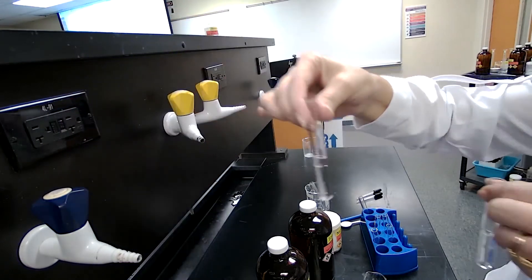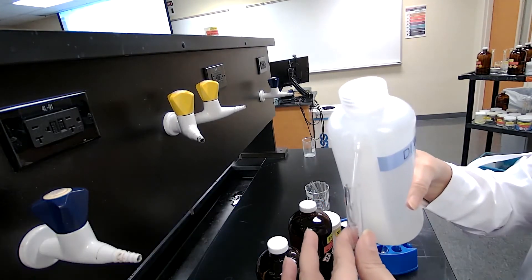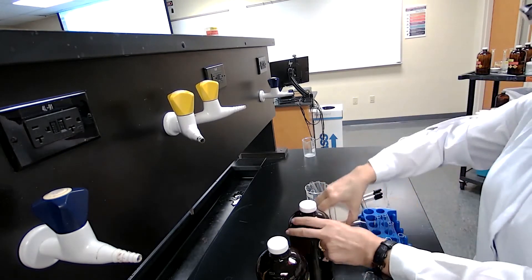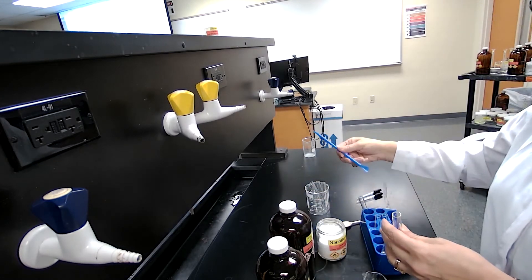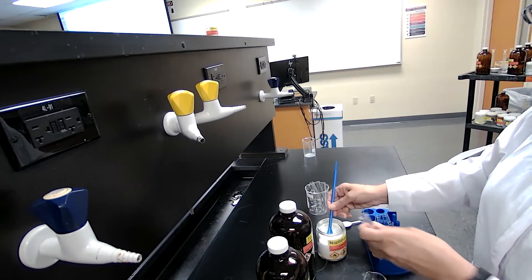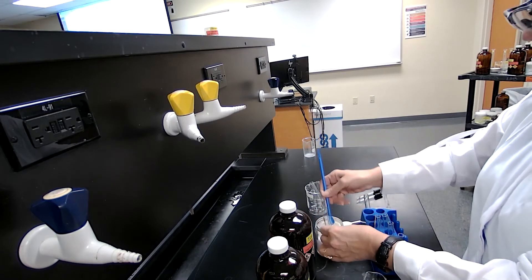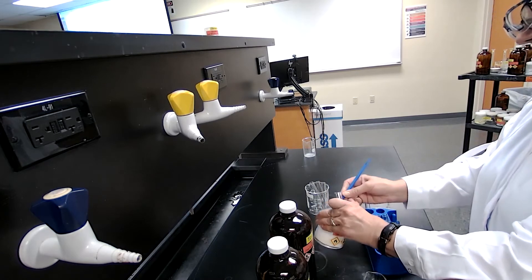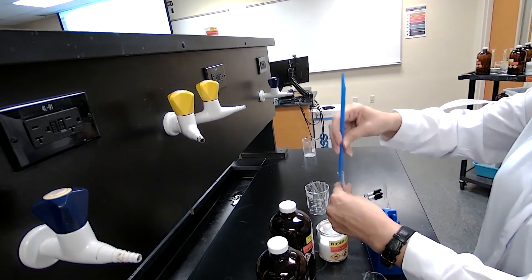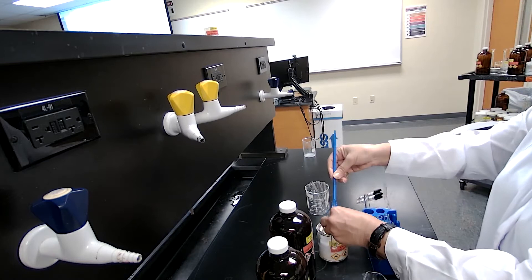For the next part of the experiment I am going to mix water with naphthalene. This has to do with the polarity of the compound. A general rule for solubility: polar compounds would dissolve in polar solvents. The procedure says to use 0.1 gram of the sample. I'm going to use about 0.1 grams — as long as I don't use too much to saturate the solution with naphthalene it should be fine — so I'll use just a few crystals of naphthalene.